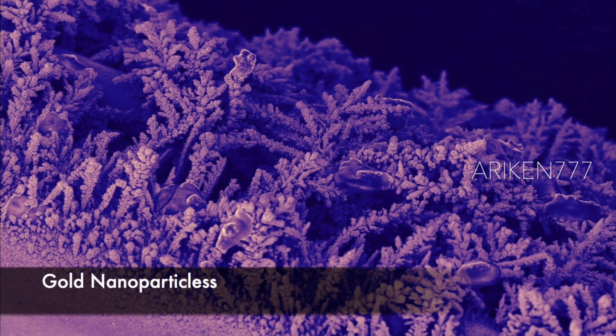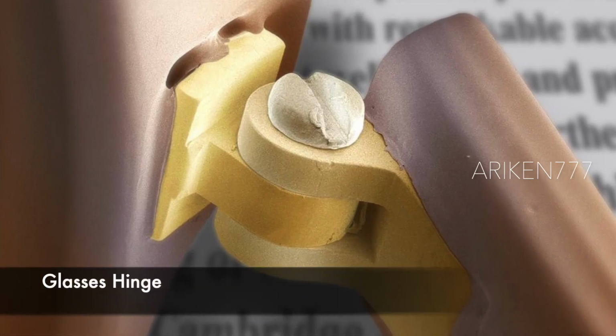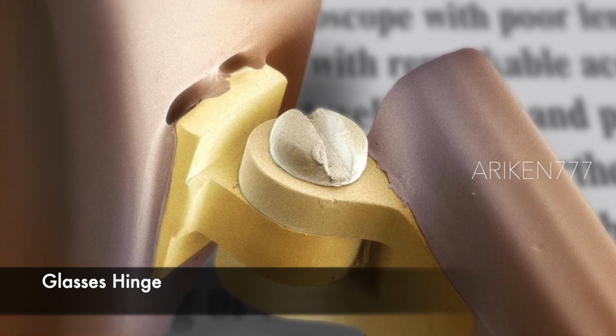These feather-like structures are gold nanostructures. As gold particles get smaller in size, they interact with light differently, which creates colors. Centuries ago, stained glass used gold nanoparticles to create different colors in the glass. The hinge between a pair of glasses and one of its arms.